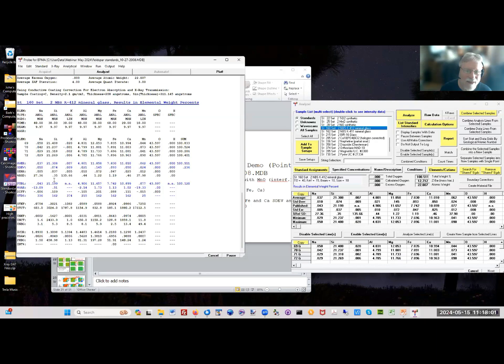One thing that PFE does that is kind of nice is it gives you the average analysis of those points on that standard, but it also tells you what the published values are for those elements in the standard database. And then it will print out the percent variance of those. You'll notice that for silicon and magnesium, which is the 162, that primary standard, and the other primary standard right here, our accuracy is excellent, 1.7 on the magnesium, 1.1 here. So about 1% accuracy on those major elements.